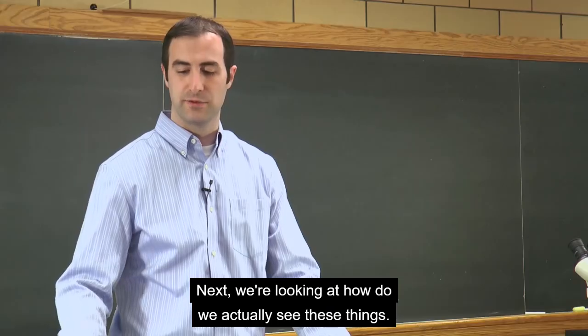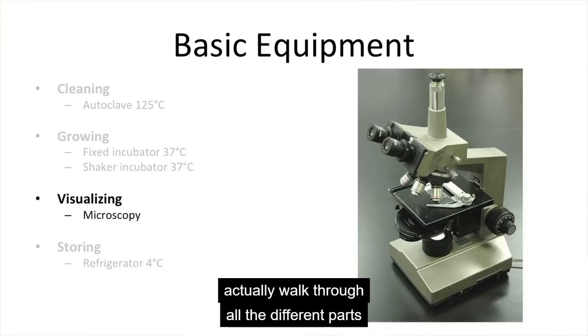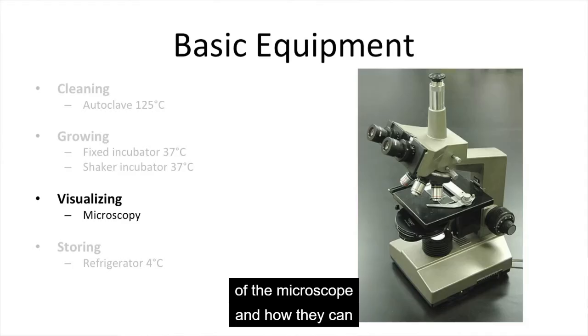Next, we're looking at how we actually see these things, and we'll be talking about microscopy. The next lessons to come will walk through all the different parts of the microscope and how they can be beneficial to visualizing your bacteria.